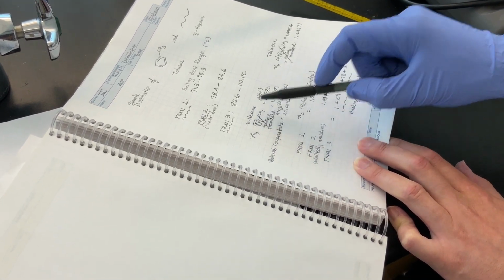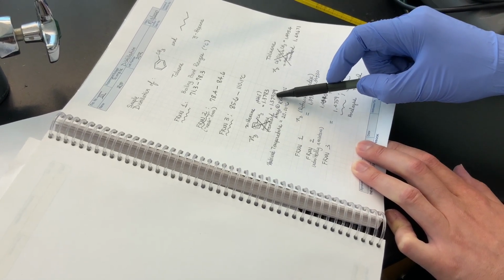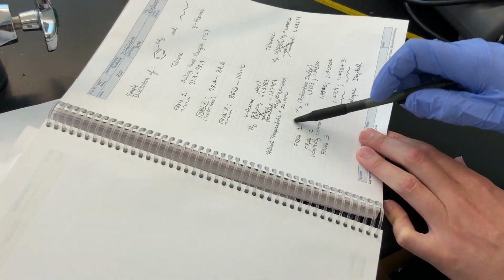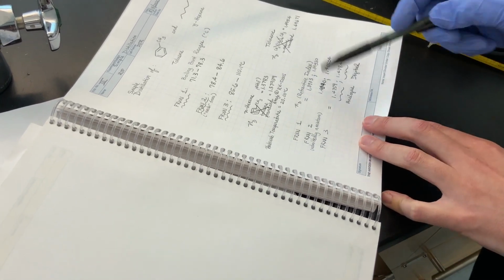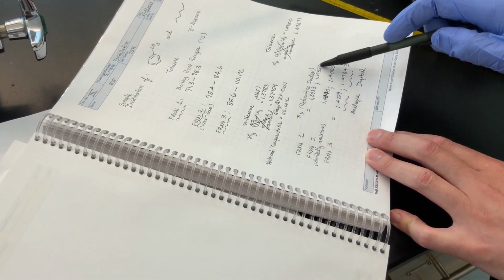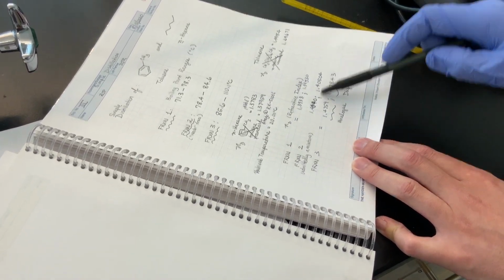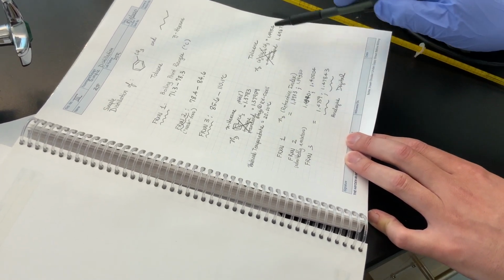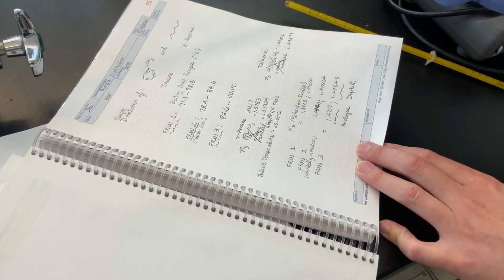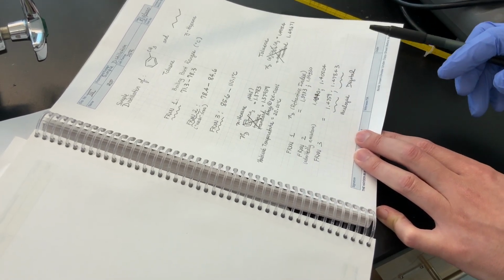And for normal hexane, our standards came out to be 1.3783 and 1.37959, analog and digital respectively. So for fraction 1, we can already tell that the measured refractive index is closer to that of hexane, and fraction 3, obviously in the opposite direction, closer to the standard refractive index of toluene. And fraction number 2 seems sort of in the middle, which makes sense to us.